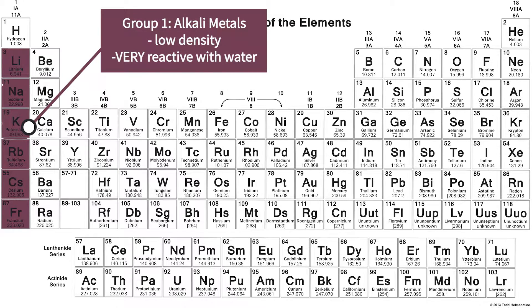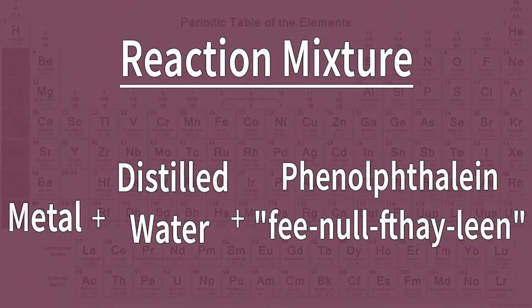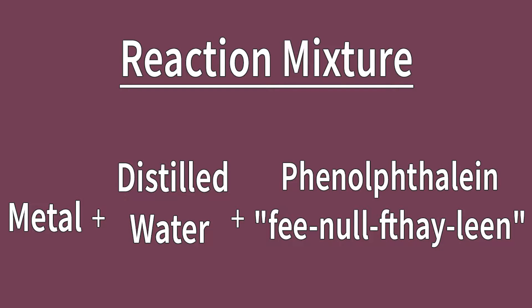The properties of the alkali metals that we'll see in today's demos are that they have a very low density and they tend to readily react with water. The setup for each of our demos today will be the same. We'll take a small piece of the sample of metal and add that to a beaker of distilled water. That beaker of distilled water will also contain a few drops of pH indicator called phenolphthalein. Phenolphthalein is clear in a neutral or acidic solution and turns a prominent bright pink color when in basic solution.